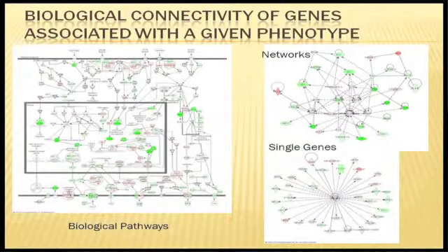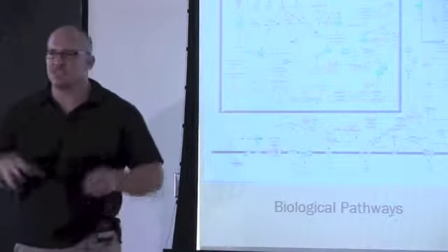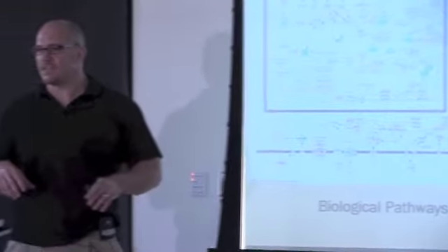Or you can actually look at just single genes. And again, this is all making footprints here, right? So here's ERB2, and here are all the genes known to interact with it. The expression of ERB2 itself goes down, and you can see green is down, red is up in expression. You can see that the expression of this is down, but a lot of its interacting partners are also down. It's leaving a footprint in your data. If you spend enough time, you can see these footprints.